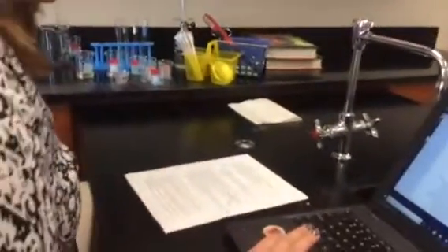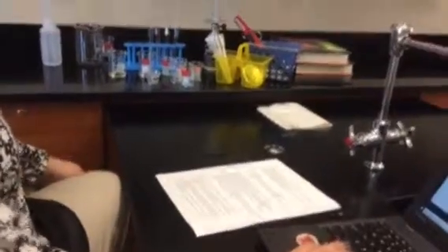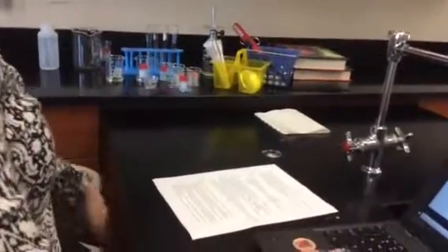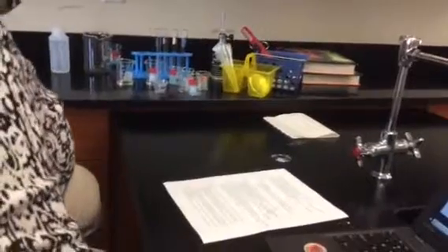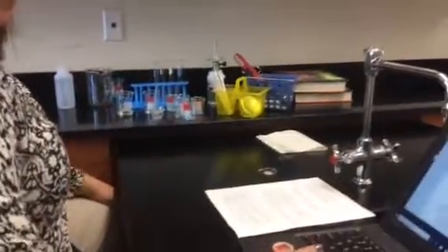Okay, so I'm just going to show you a couple of things for tomorrow to make it a little bit easier on you, hopefully. The chemicals that we're using in the lab are not great for you, so I wouldn't get them on me or waft them or do anything. Clearly, goggles, gloves, and pants, and hair back for sure. Tomorrow, silver and lead-based chemicals are toxic. Do not pour them down the sink, so we'll just put them where I tell you to.